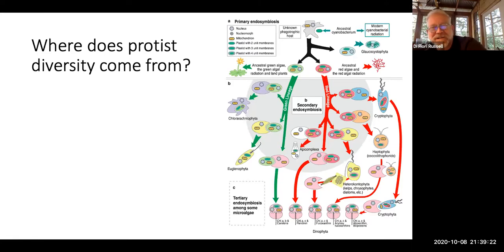Maybe you know from our discussion of evolution that endosymbiosis is the evolutionary origin of most of the different protist or eukaryotic cell types. And as you start to do this, you might start to recognize some of these, like here's Euglena, right? There's the green algal lineage where you have a chloroplast with chlorophylls A and B, and then that merges with a flagellate. The green algal cell to begin with becomes the internal organelles of the larger organism, which is the Euglena.